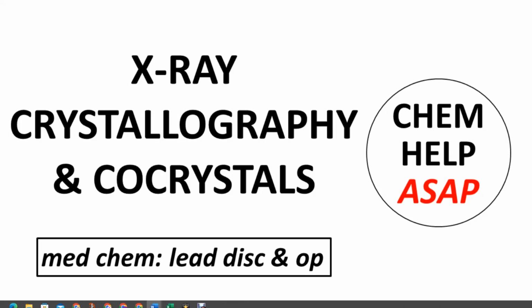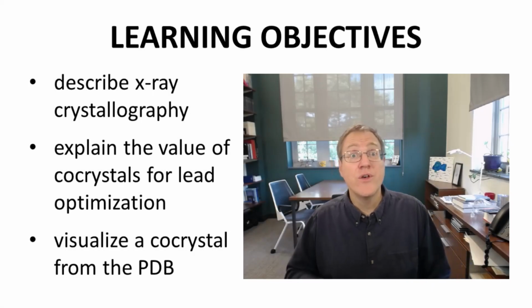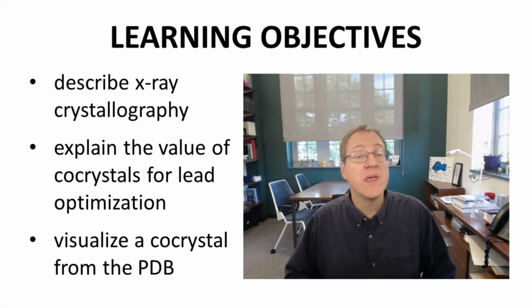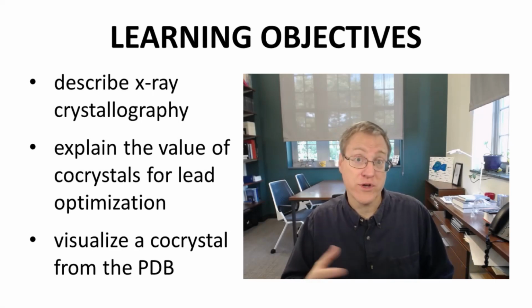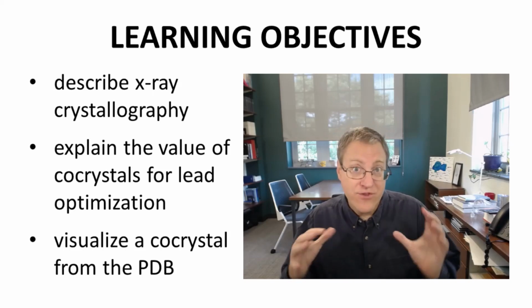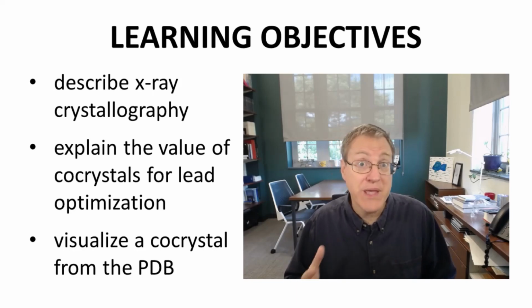In this video, we will discuss X-ray crystallography, which can be fantastically helpful for lead optimization. Upon completion of this video, students will be able to describe X-ray crystallography, explain the value of cocrystals for lead optimization, and visualize drug target cocrystals from the Protein Data Bank, the PDB.